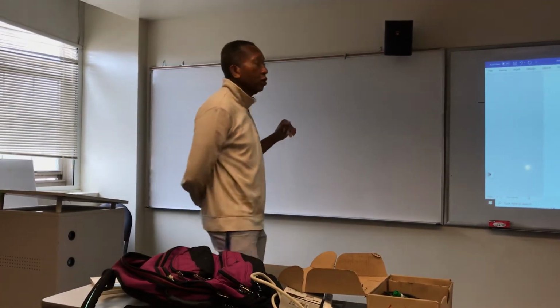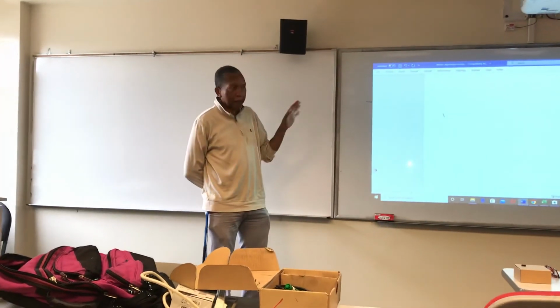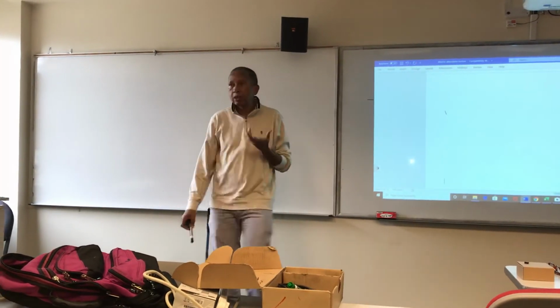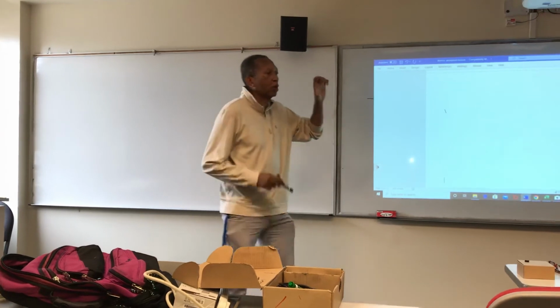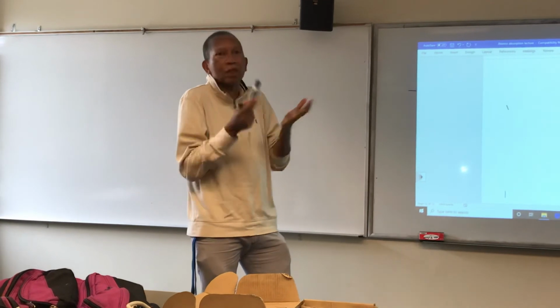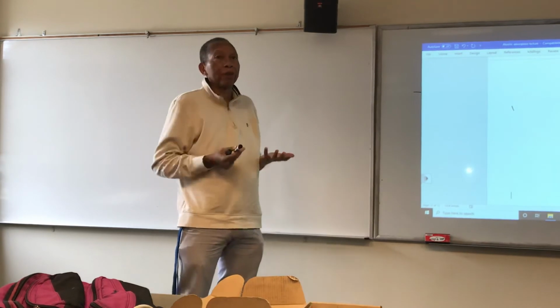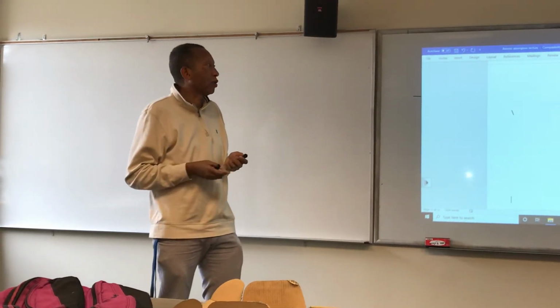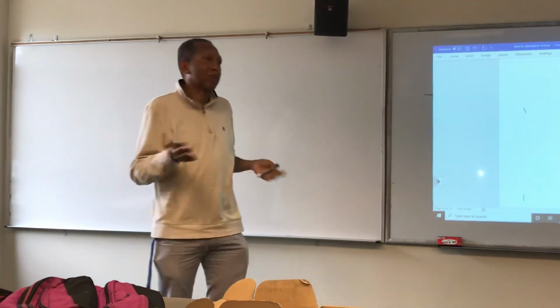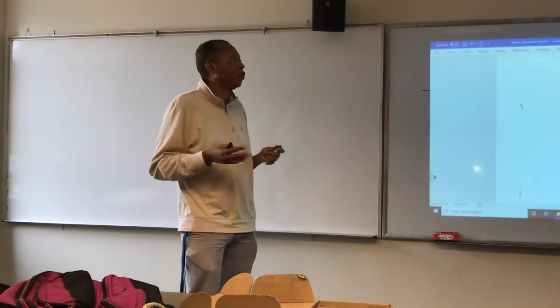The next lecture I'm going to do is going to be on fluorescence, which is really another nice, exciting topic. You might have seen fluorescence before. Fluorescence is if we take a sample, let's say a solution, and we shine one color light on it, the whole sample becomes another color. So we shine blue light on the sample, and the whole sample glows green. What we're going to do is to figure out, first of all, how that works, and then what type of instrument is required. If you open a fluorimeter, what type of instrument is there?